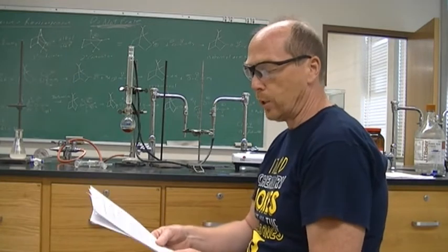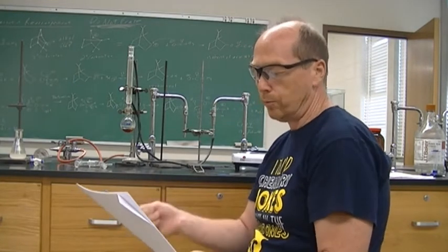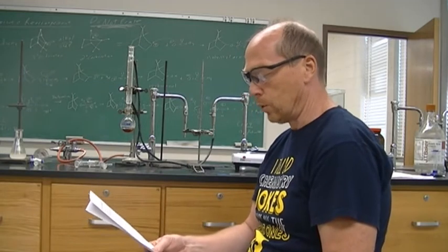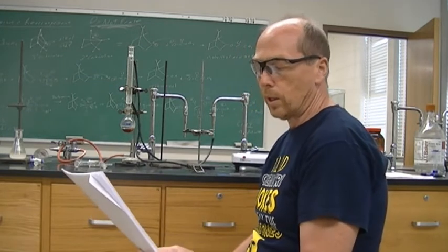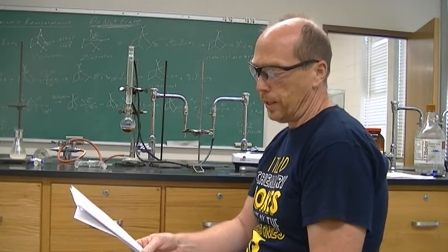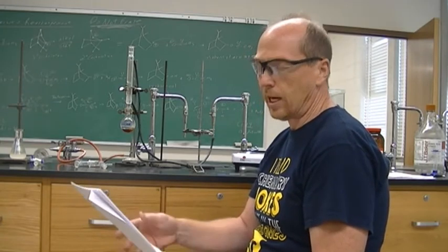take our isoborneol, which we're going to weigh, and we're going to add some acetone to that, and then we're going to add some chromic acid for the oxidation, swirl that for 10 minutes, and then we're going to add some water, and then we're going to do a very different type of distillation.